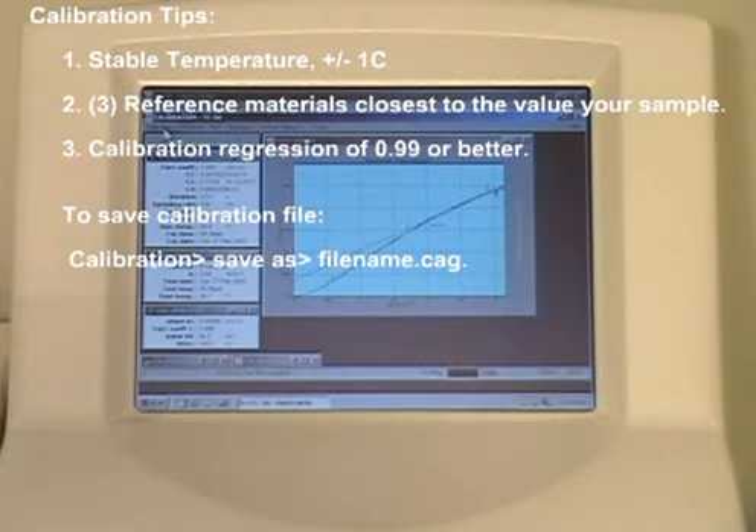And finally, to save your calibration, click Calibration Save As in the top menu bar of your software.